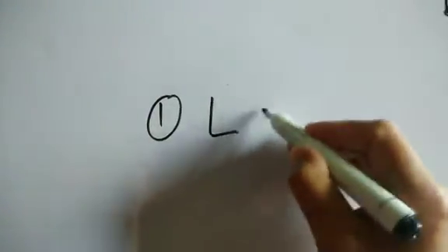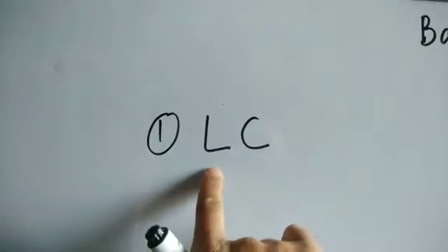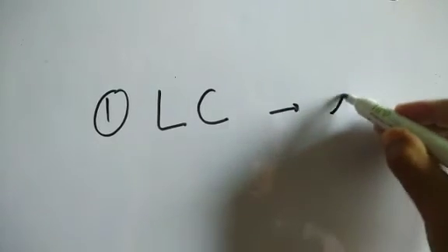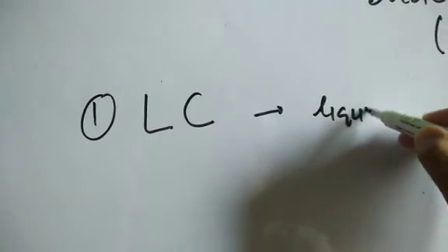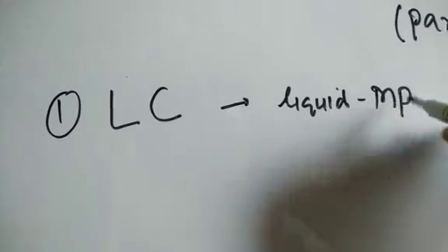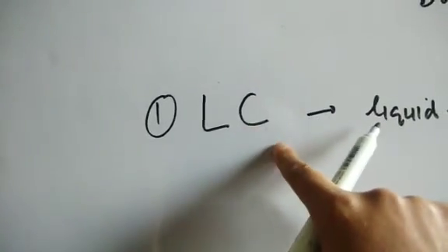जो हम chromatography में देखते हैं, अगर आप books देखोगे you will see some more terms. For example, we'll come out with a term number 1. अब अक्सर term देखोगे LC. LC means basically liquid chromatography. So when we are using liquid as the mobile phase, MP, that means it is called liquid chromatography.